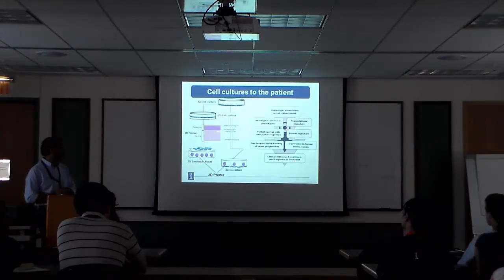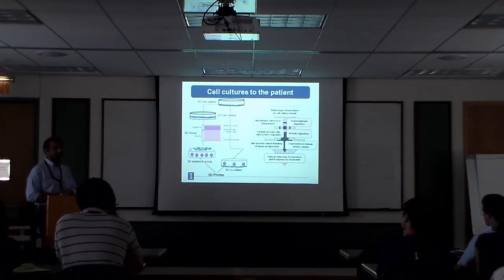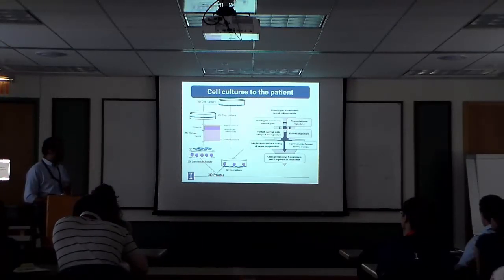What commercially they don't do is put melanoma in here, so we would stick melanoma in, watch it grow over time and so on. Then we slowly built up capability over the last few years, and now we routinely do these kinds of things in the lab that we call spheroidal co-culture models. There are two challenges in this.